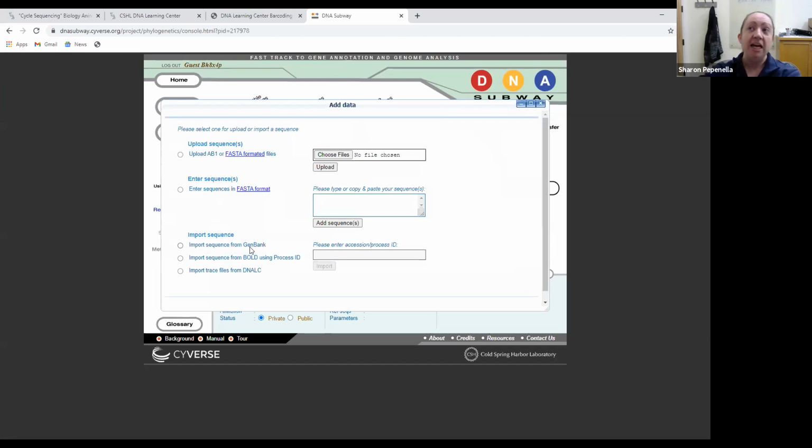So for example, we've had organisms before where the closest match is not the species that we know it to be, but that species' sequence data is available in GenBank. So we want to bring in maybe some of those species directly from GenBank and do an alignment, look at all of those sequences. You can actually do that by adding the accession number here.